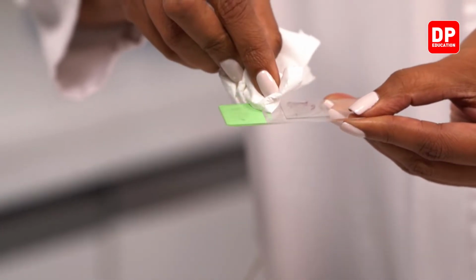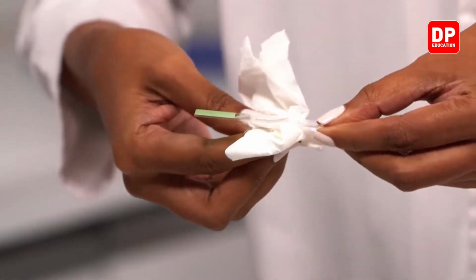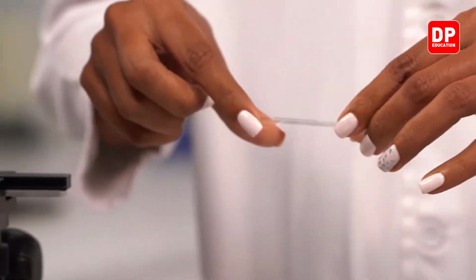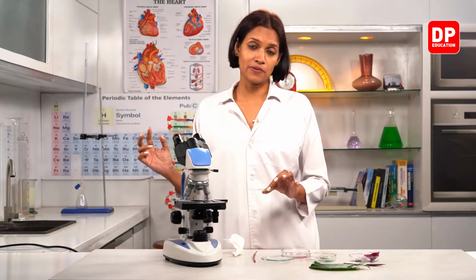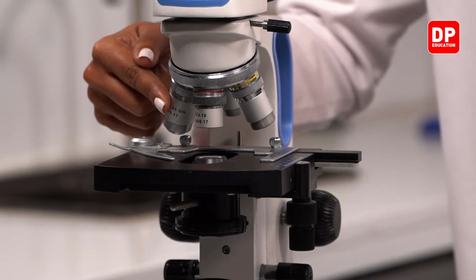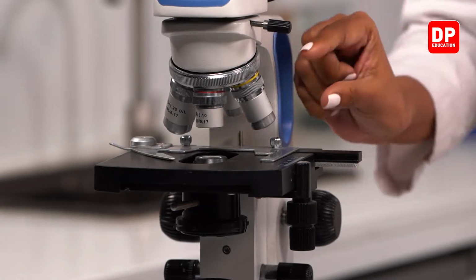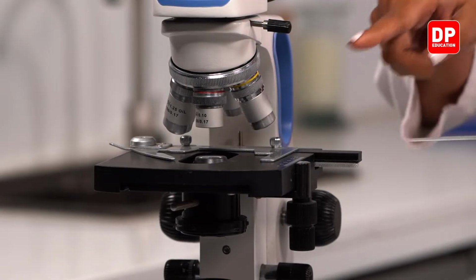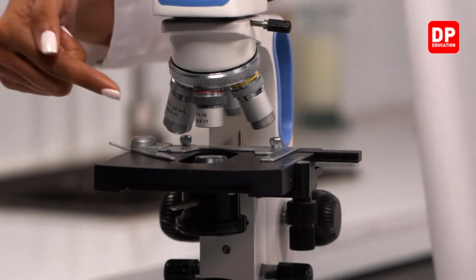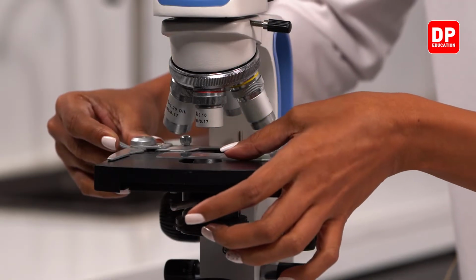So you all know that we have to always wipe off the slides with a clean piece of cloth or cotton, right? And now we need to mount this. We need to place this on the stage, right? So you all know that before we place this, you all have to make sure that the low power is on. Otherwise, if the high power is on, what happens? Because they are too long, the slide might damage the objective or the lenses, right? Therefore, now the low power is on. Therefore, I'm going to mount it like this.